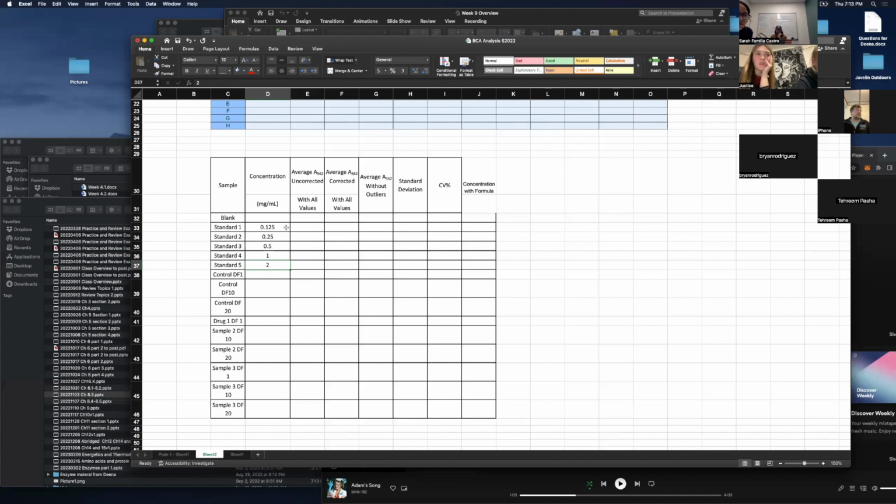Any questions so far? Okay, so we need a concentration column. We need an average absorbance. Someone wants in. My bad. Sorry, Salma, I didn't see the thing popping up on my screen.